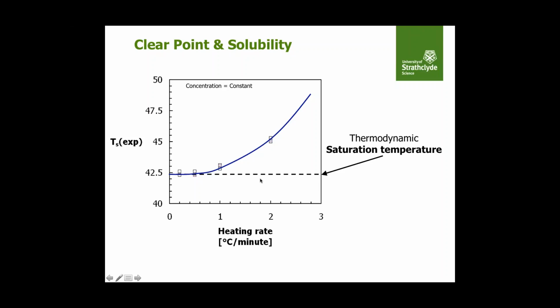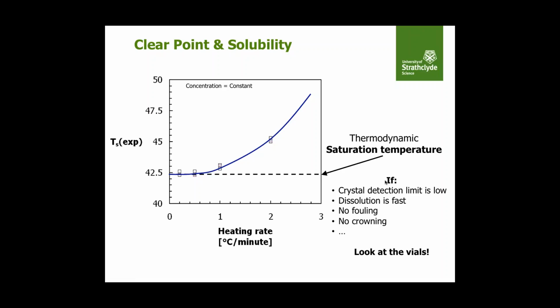So we can here identify a saturation temperature, which would be the clear point temperature at very low heating rate, and that would be about 42.5 degrees. That would be really the thermodynamic saturation temperature if your crystals dissolve fast enough, if your crystal detection limit is low enough, and if you don't have fouling, crystals sticking to the vial wall, or crowning, that would be crystals that stick just above the liquid level in your vial.